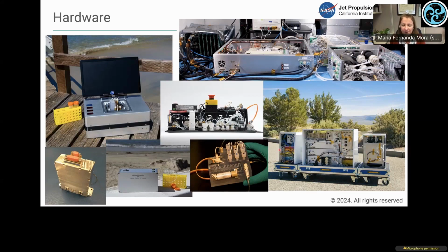I didn't talk about it today, but Aaron actually has a project doing ion selective electrodes, which also complements very well all of the types of analysis that we can do. The point will be to get the most possible chemical information of a sample with a single instrument by combining all of these detectors.